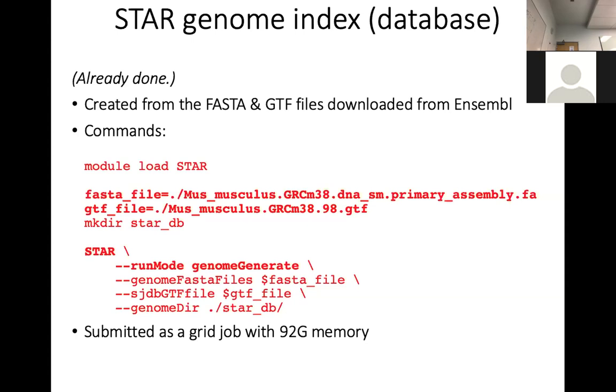So the sample equal is usually for this sample variable. So whenever you see the sample variable, same thing with STAR, it's actually going to be replaced by this. Then this command is already valid one way. Okay, this is where my sample has to be.